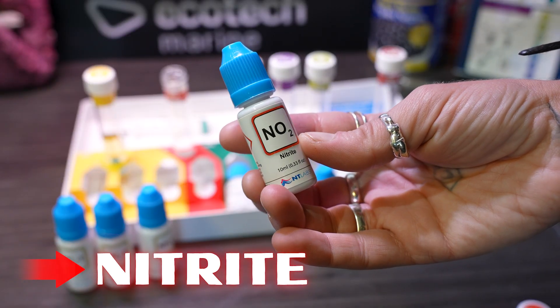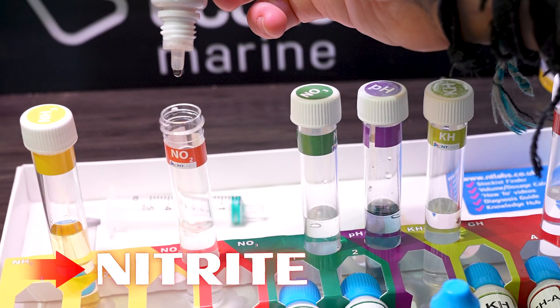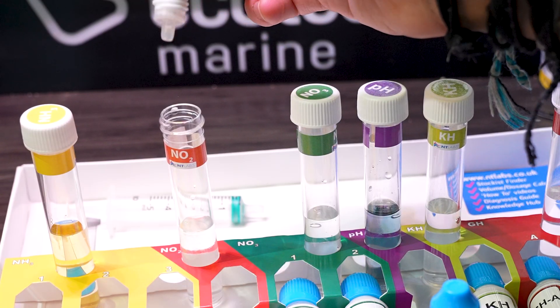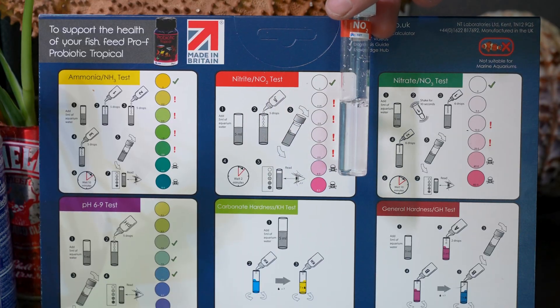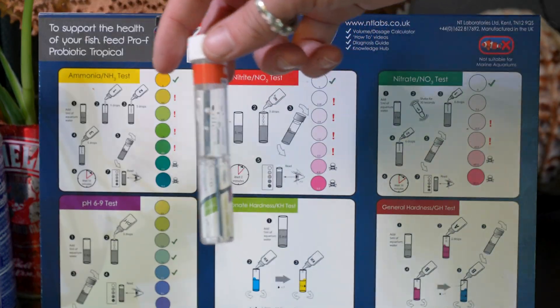So next up, nitrite. Nitrite is produced by the beneficial bacteria in your tank as they break down harmful waste ammonia. Although not as toxic as ammonia, nitrite is still harmful to your fish's health. So far, so good. Let's move on.